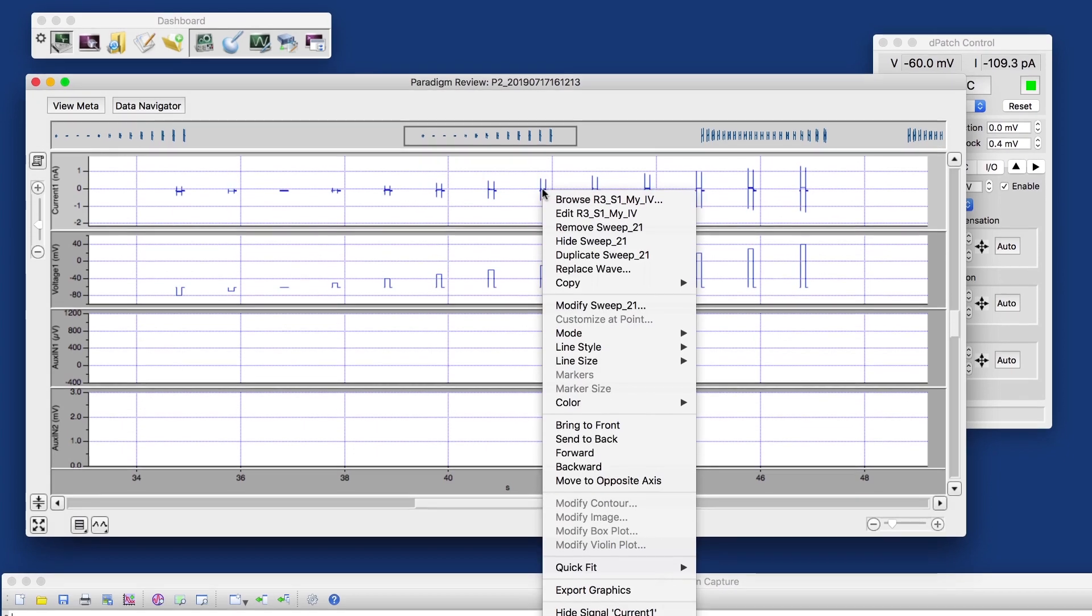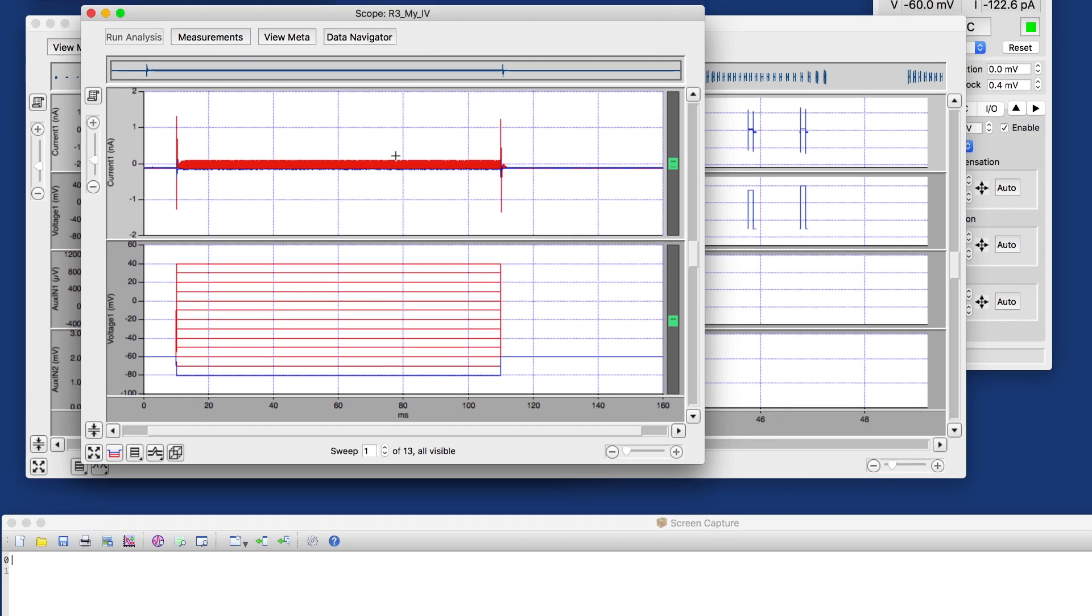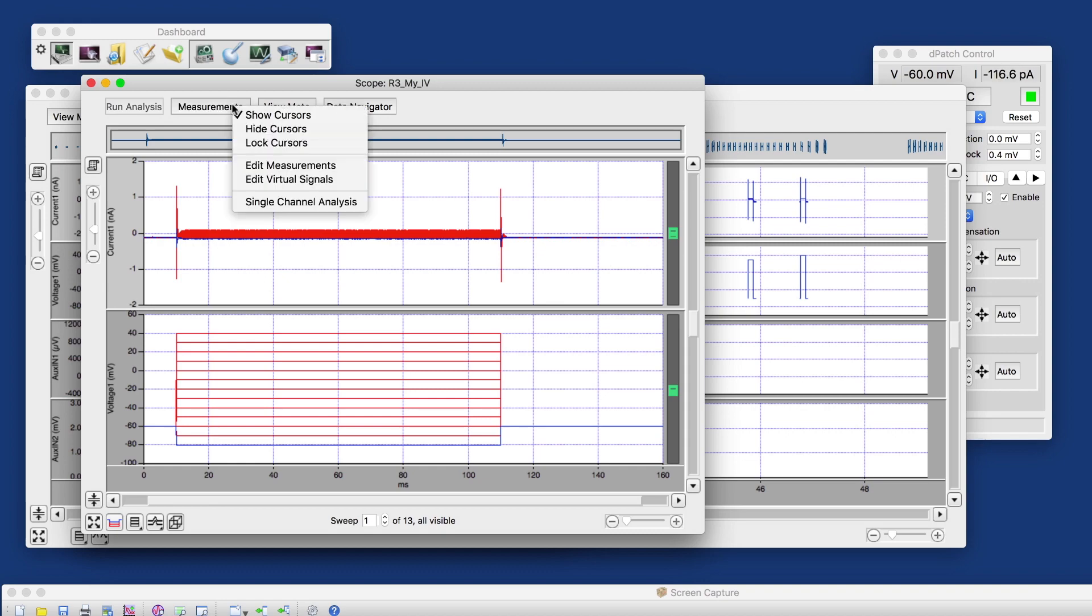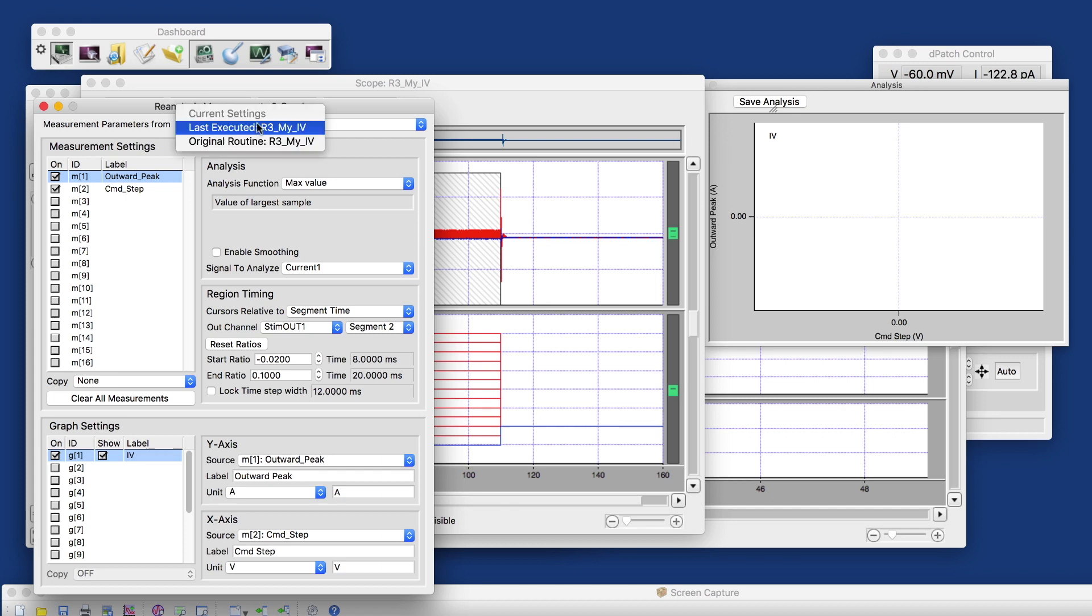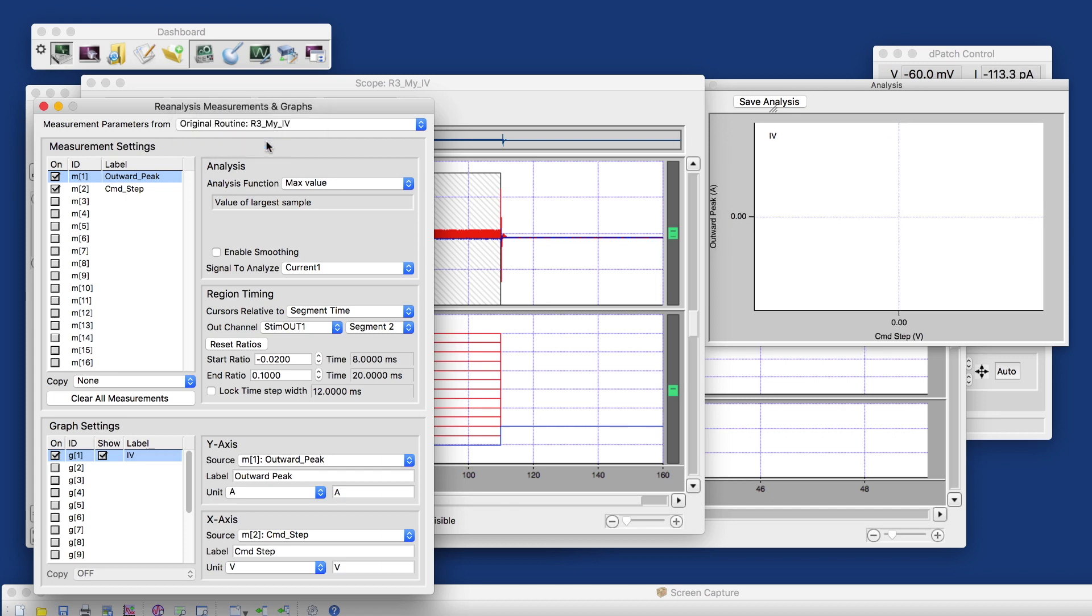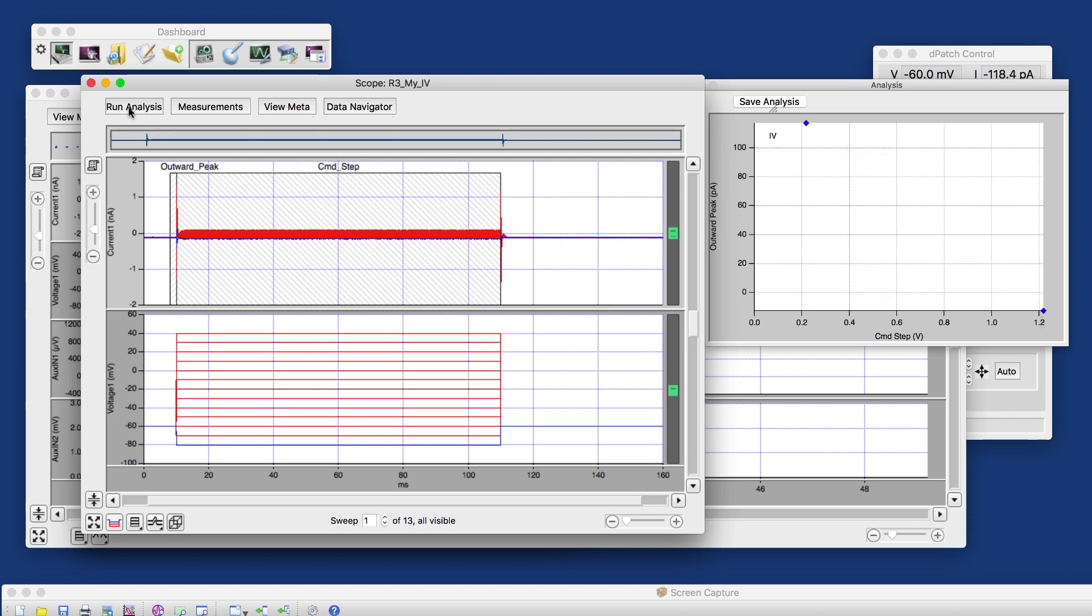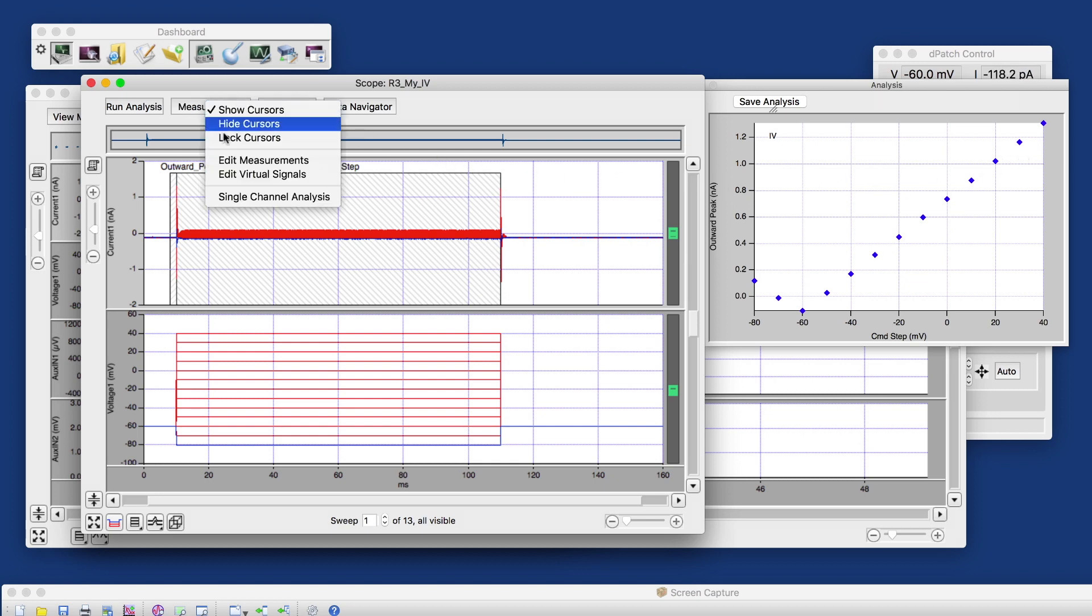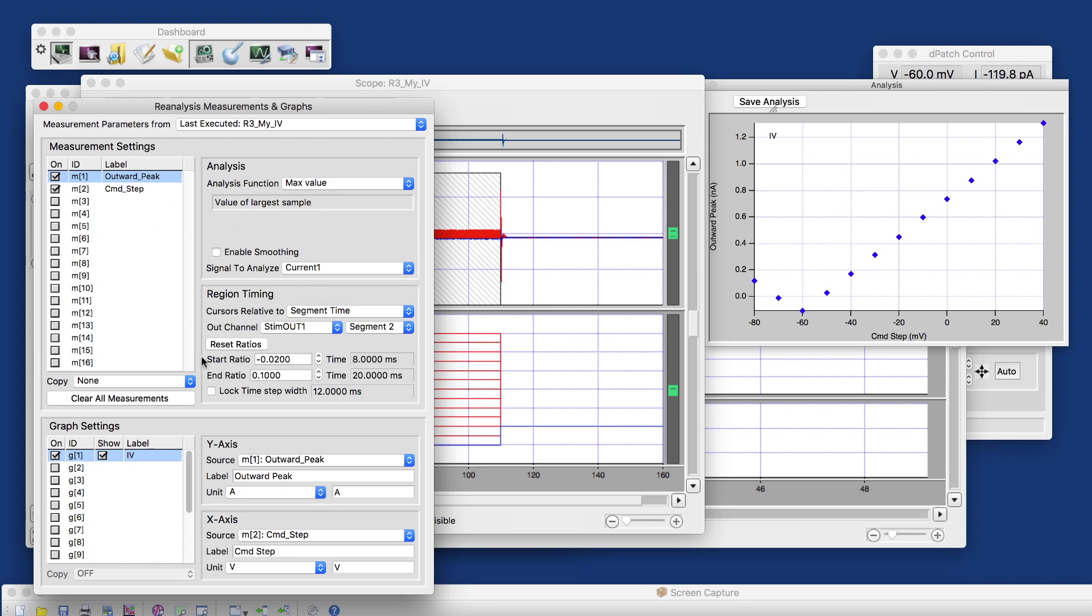And if I highlight this one, right click on it and go analyze, it'll open this routine data set, this series in a reanalysis scope. And now I can edit the measurements, look at either the last executed or the measurements that were stored with the original routine. And as I run the analysis, it recreates the real-time analysis, the IV that we plotted in real-time. But obviously, we can change the measurements if we want to look at something else.